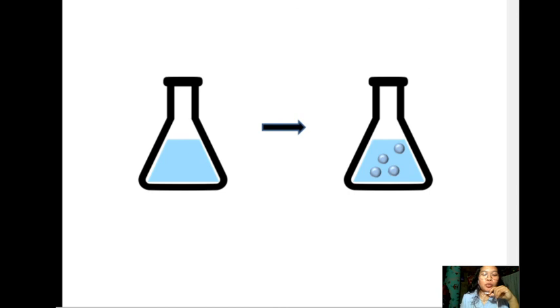In each run, 25 ml of solution of a certain initial concentration will be contained in a volumetric flask containing 0.1 gram of beads. Concentration of methylene blue will be examined when adsorption equilibrium is reached.